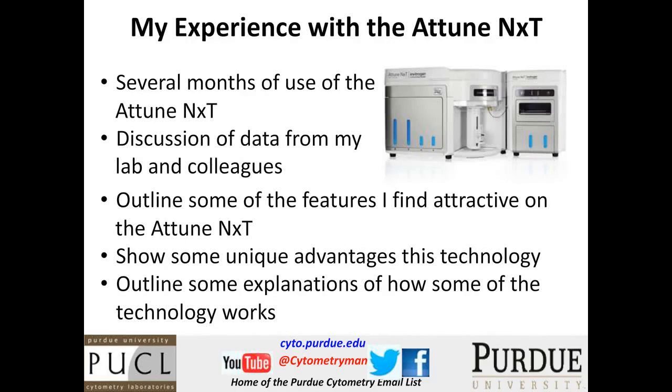So for the next 45 minutes or so, I'm going to discuss my experience with the Attune. In the last several months, I've had the opportunity of playing with the Attune in my lab, and I've spent quite a bit of time with colleagues who have this instrument, and of course my lab staff who've been using it. And I thought that this would be a good opportunity to outline some of the features that I find attractive about the Attune instrument.